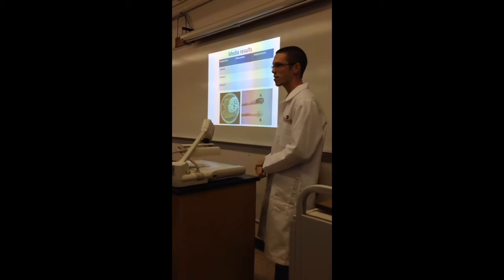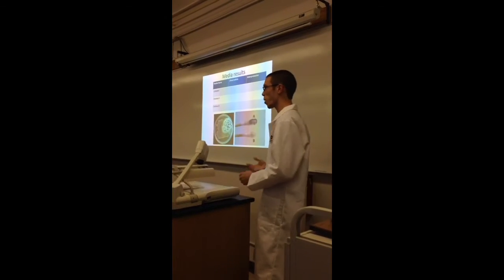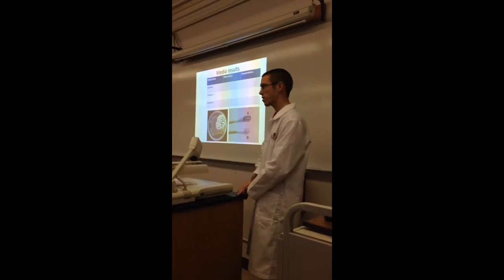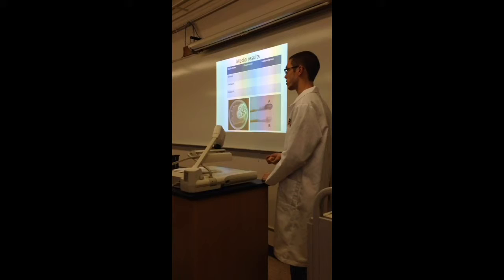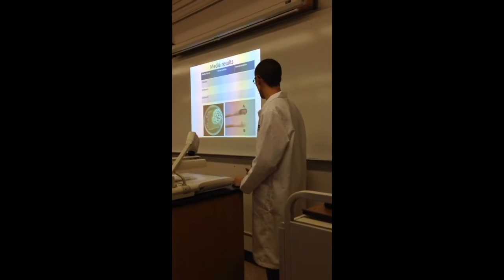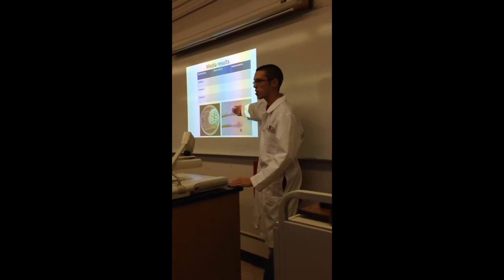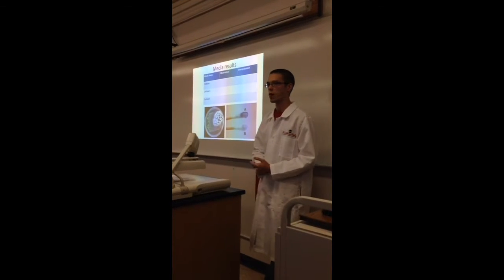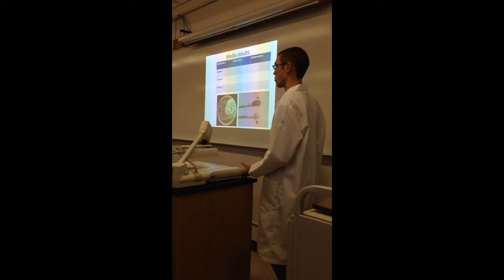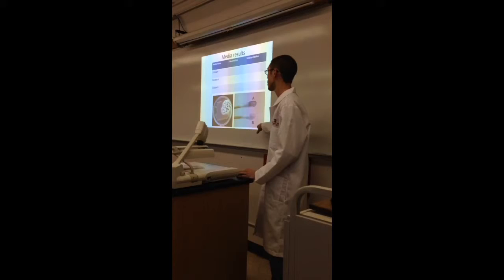And what about oxidase A? Purple. Yeah, there's some sort of purple thing formed. And what about B? No purple. No purple, exactly. So that's where knowing what the test is and what the possible reactions are comes into play. If you didn't know what the possible reactions for oxidase were and you only had part B, then you wouldn't necessarily know what to say, right? So it's important to know what they are so that you can know what a positive and negative result is. And if you only see one, to know that that is a result and what it means.